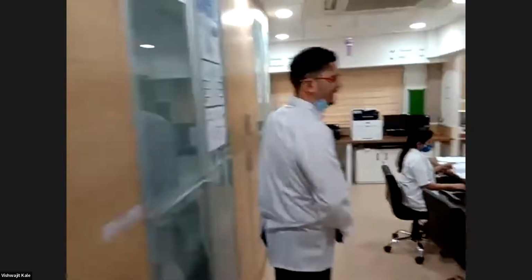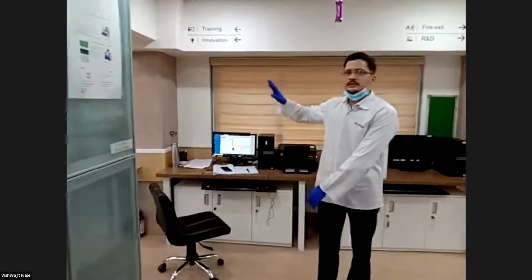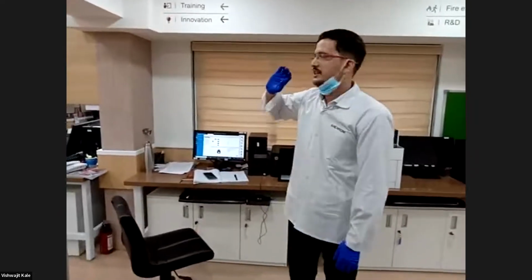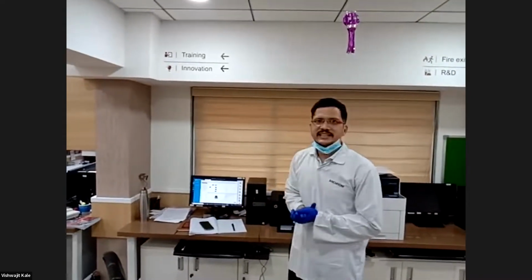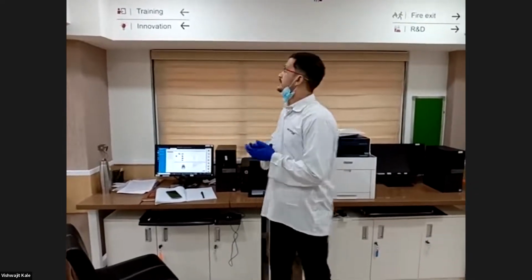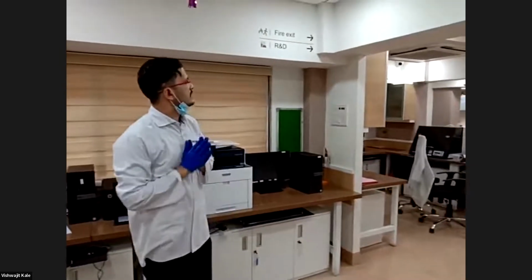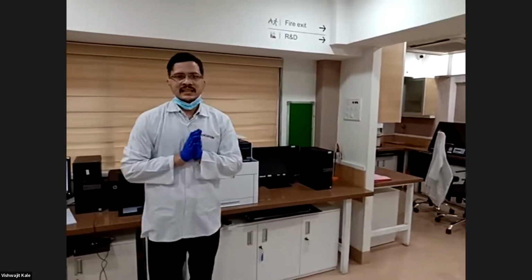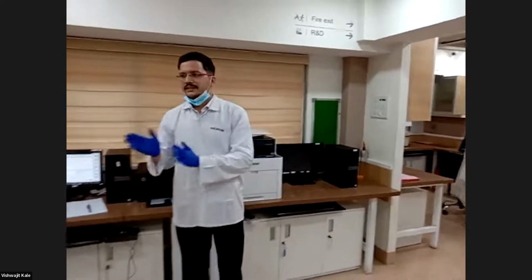So this is the entry of our laboratory. We have different zones dedicated to each and every training step. We have the training area here. Then the innovation area, where we have kept the latest development in planar chromatography, that is HPTLC Pro. Then we have the R&D and wet laboratory. We also follow some safety measures while doing analysis in the laboratory. So we have a wet laboratory and a dedicated CAMAG HPTLC R&D center here.